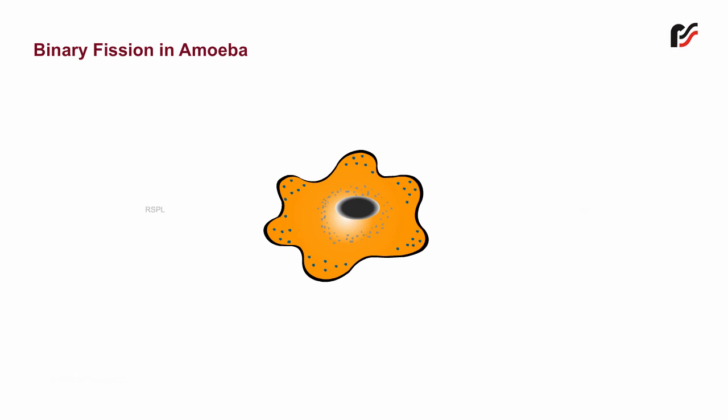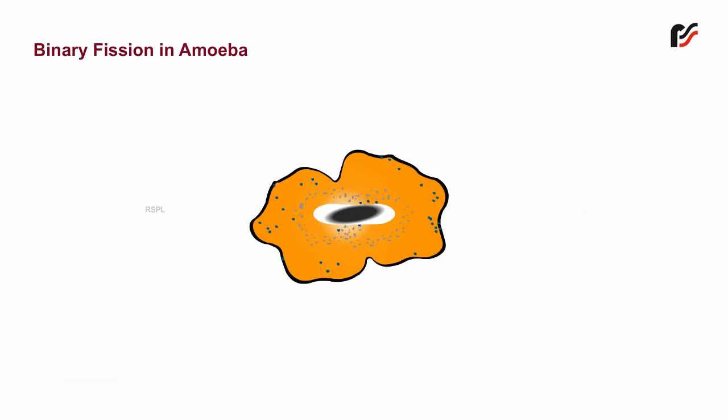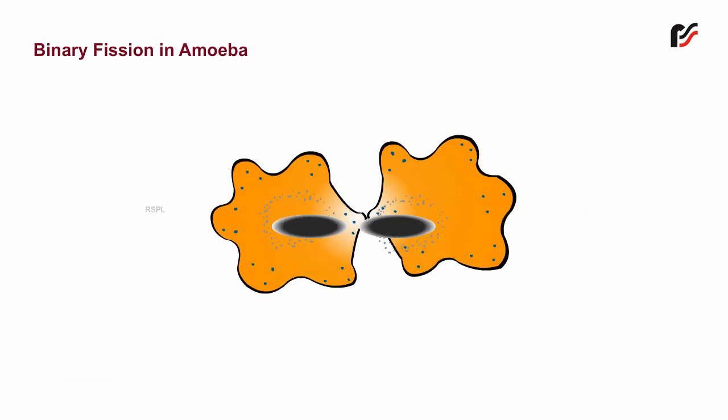Observe it. The parent cell becomes elongated. Without removing the slide, now change the focus to high power. Observe it. The nucleus divides amitotically first, and then the cytoplasm divides. At the point of fission, a constriction appears and deepens to divide the cell into two cells.